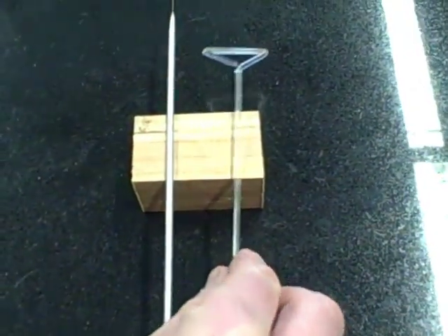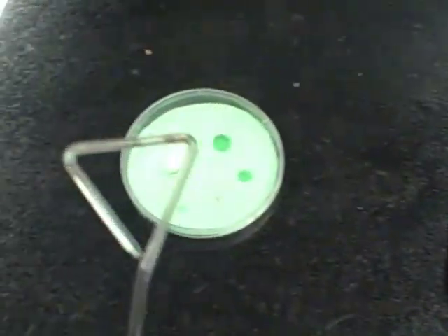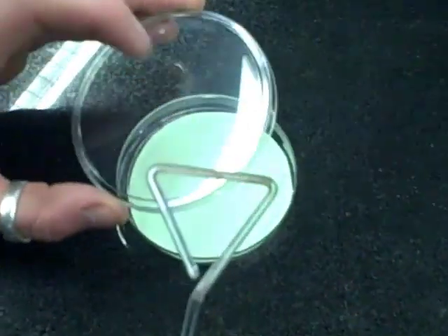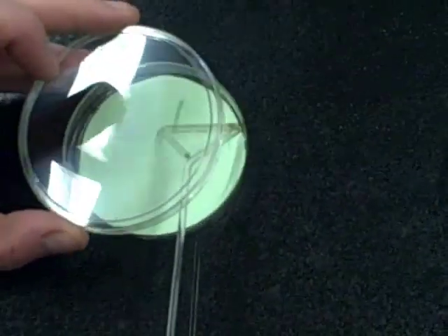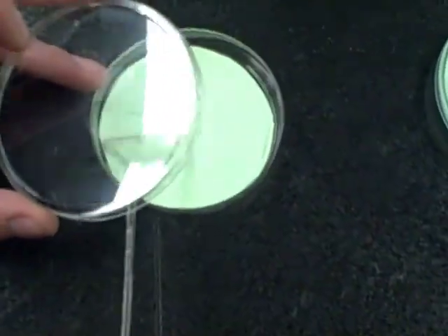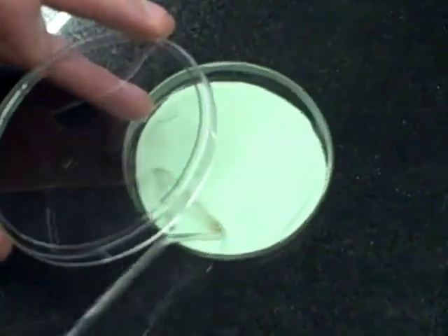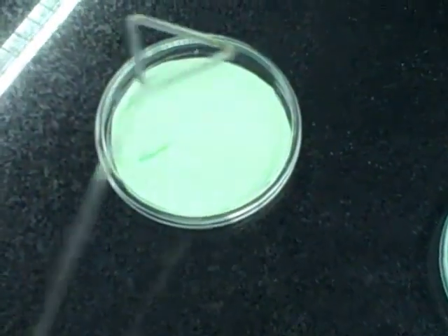Our second last job is to spread the bacteria out more with our glass spreader. So we come over to our new plate, open it — not letting things fall in — and spread out our bacteria all the way around so the whole plate is covered. We won't see anything at this point because it's so small, but the whole plate is covered. We keep it closed to keep it sterile.